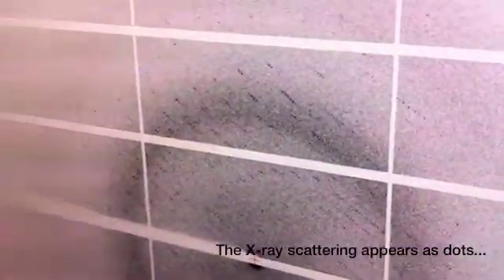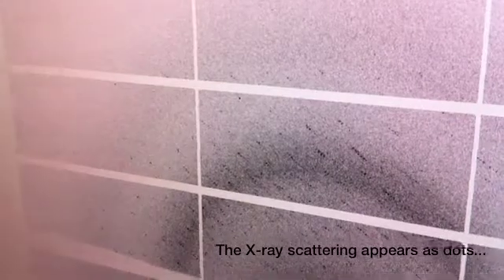Are you happy with the way things are going? Yeah, I'm happy. What about Owen over there? Are you happy? I'm delighted with it — things are going well, processing stuff, and hopefully we'll get a full data set. And these are the images. Not bad at all. 0.2 degree oscillation. Not bad at all.